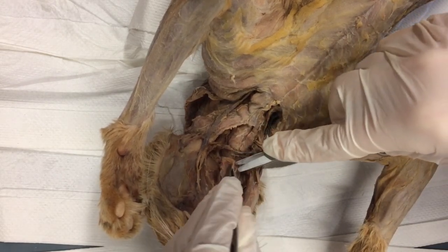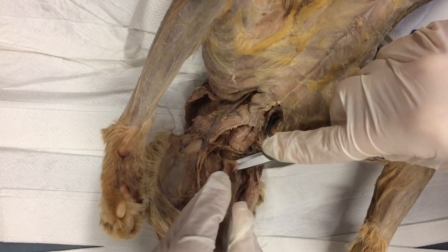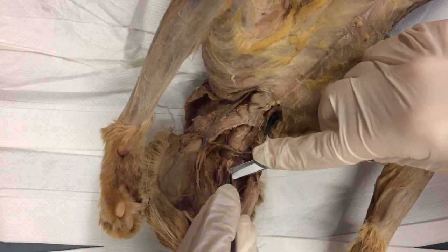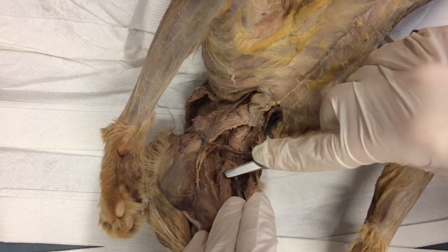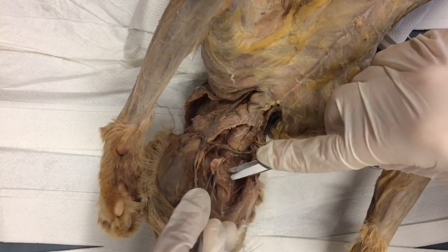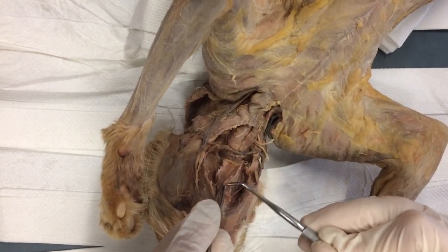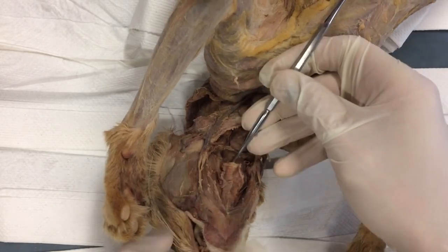I'm gonna free that up, and I'm doing little tiny nips. And this whole thing's gonna free up. This is gonna be really cool. Boom. Remember, you gotta be deep enough to get under this one, but not so deep that you're damaging this one. Right where it's real white. If you have to come back in with your probe, clear right to the line. Right to the line. I'm gonna wiggle up here.